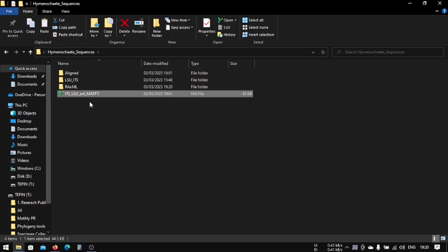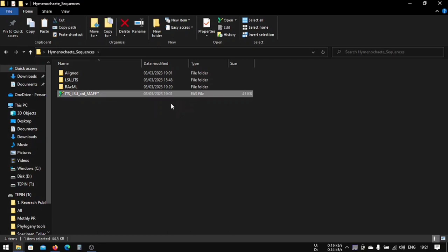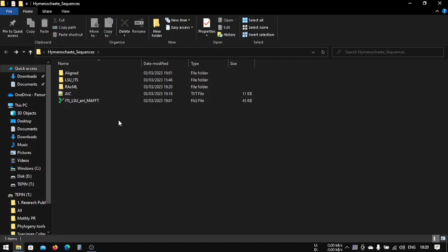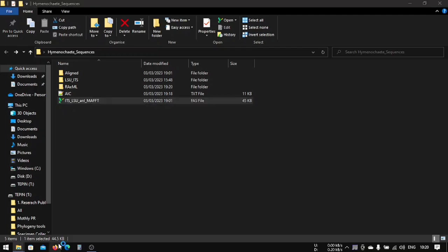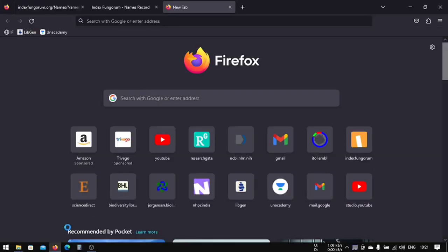Now that we have this file, we cannot run this file because this file is in FASTA format. We have to change this FASTA format to phylip format. In order to change this FASTA file format, we have to download another software which is called Mesquite.